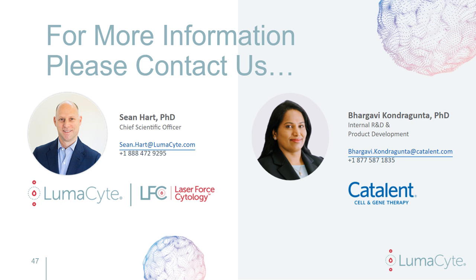In terms of method development, this is also easy, right? Principally because we're so much faster, right? If you're not waiting a week to get your results, right, you can iterate on the method development much more, and have a much faster turnaround time, right? Being one of the key advantages.